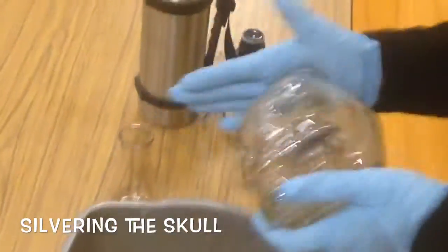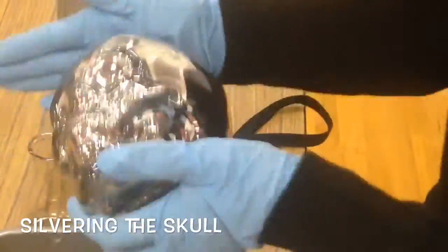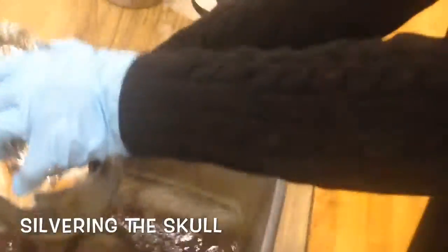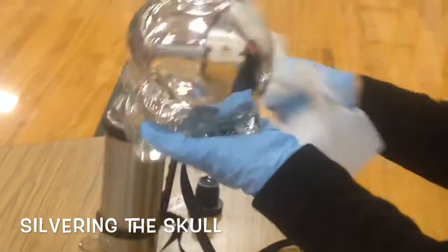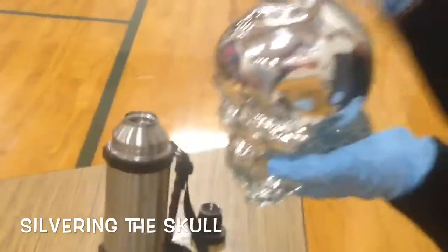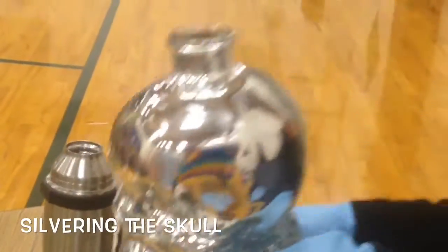Now remember we started with silver nitrate? Can you see what's happening? Yeah — it's silver. It is silver. What I just did was the silver nitrate that I started with has now plated out on the inside of the glass as a mirror. That's pure silver, thinly coated on the inside.